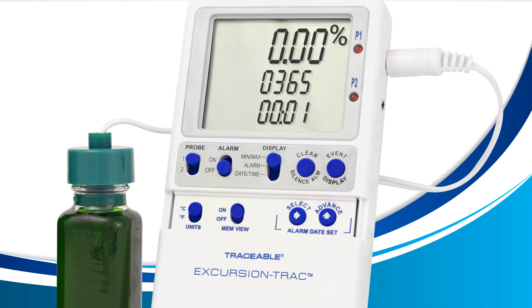If you'd like to change the logging interval, that can be done with the advanced button on the right. Each press will increase the interval amount. Keep pressing the advanced button until you have the interval you need. If you pass the interval you need, keep pressing the advanced button until you reach 24 hours. Once you press the advanced button while at 24 hours, it will restart to 1 minute.